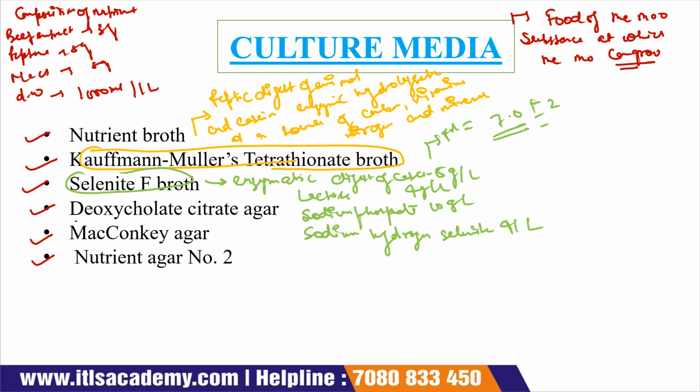Next is your deoxycholate citrate agar. It contains different ingredients. Now the composition of this deoxycholate citrate agar is what it contains: sodium citrate.